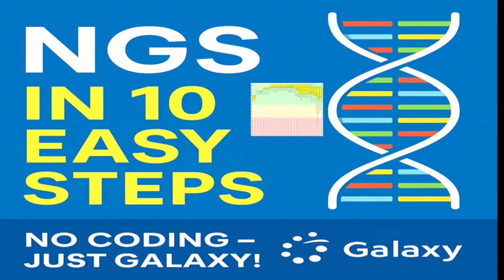Hello everyone, welcome to this tutorial on NGS basics and quality control in bioinformatics using Galaxy. Before starting, let me tell you about the Galaxy server. Galaxy is an open source, GUI based, no coding required platform where you can perform various kinds of bioinformatics work, and this video will be useful for beginners who are working with DNA or RNA sequencing data.